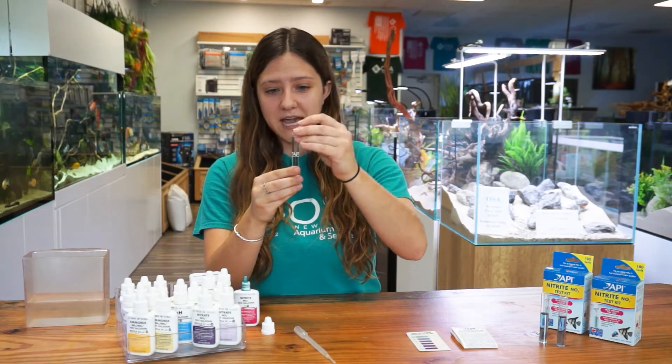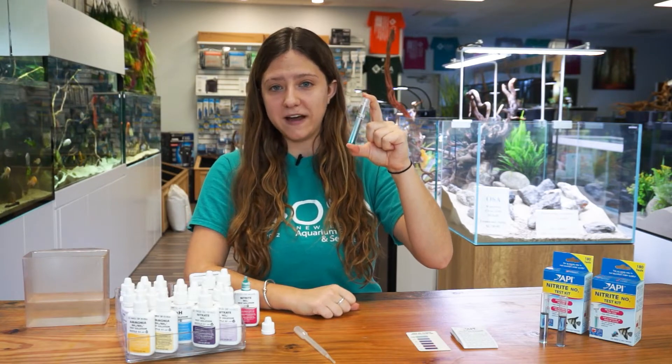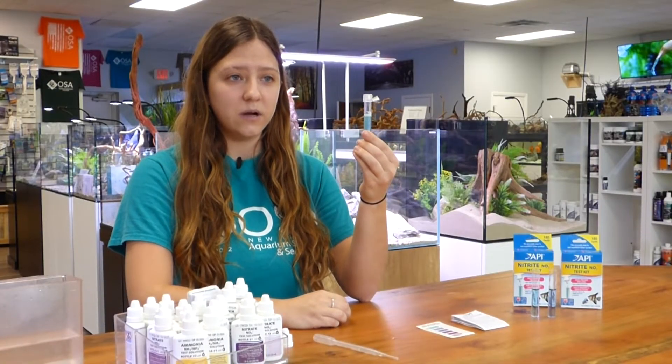After you add five drops, you are going to cap your test tube, and you are going to vigorously shake for five seconds. Now that I have shaken the test tube, we are going to put it down, and we are going to wait five minutes for it to develop.